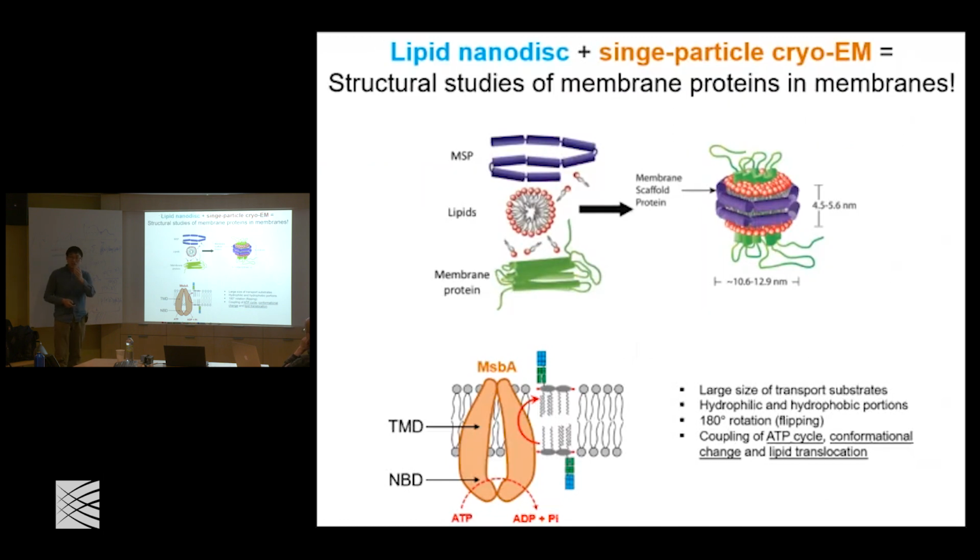Now this goes back to your lipid question. We are big believers in lipid membrane, and we believe membrane has a fundamental regulatory role for any membrane protein. The method we prefer combines lipid nanodisc and single particle cryo-EM to study membrane protein in a small patch of membrane.